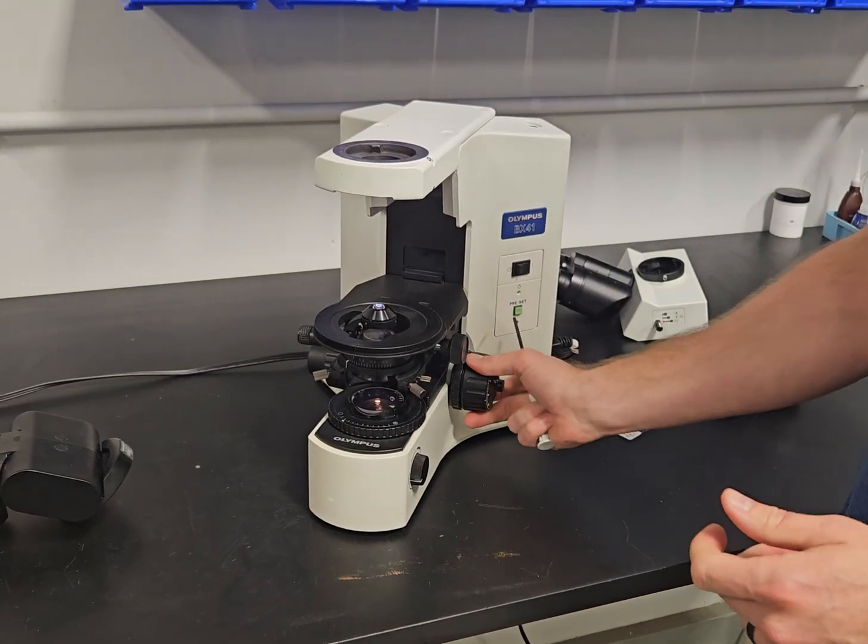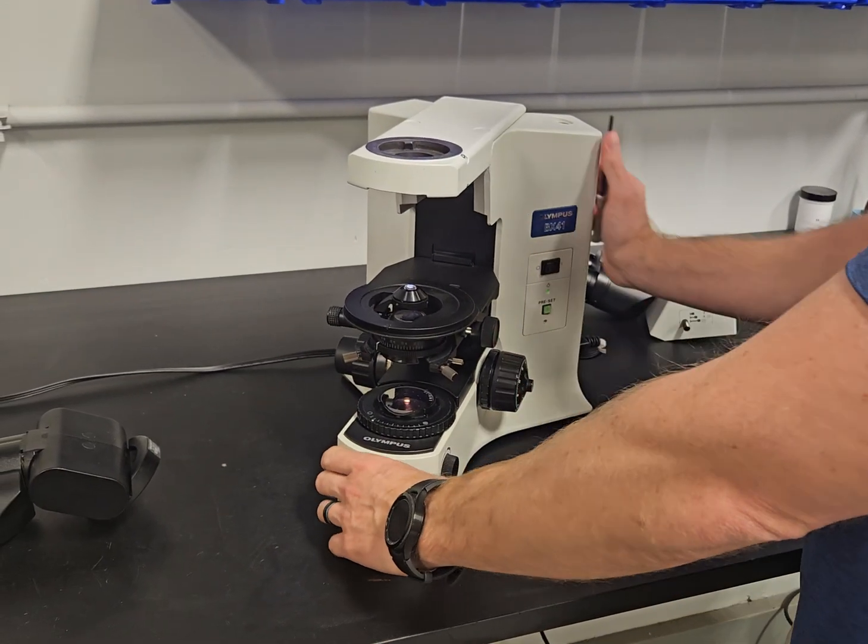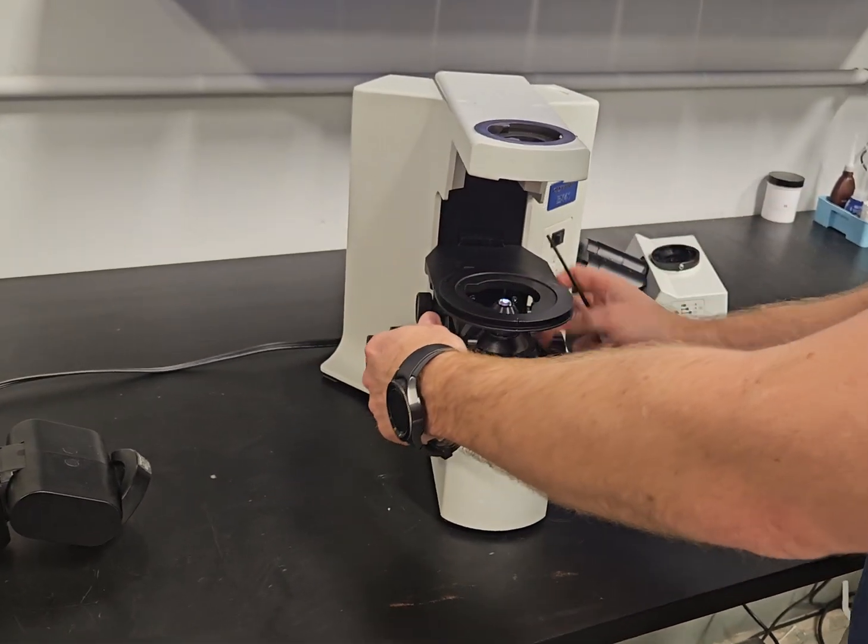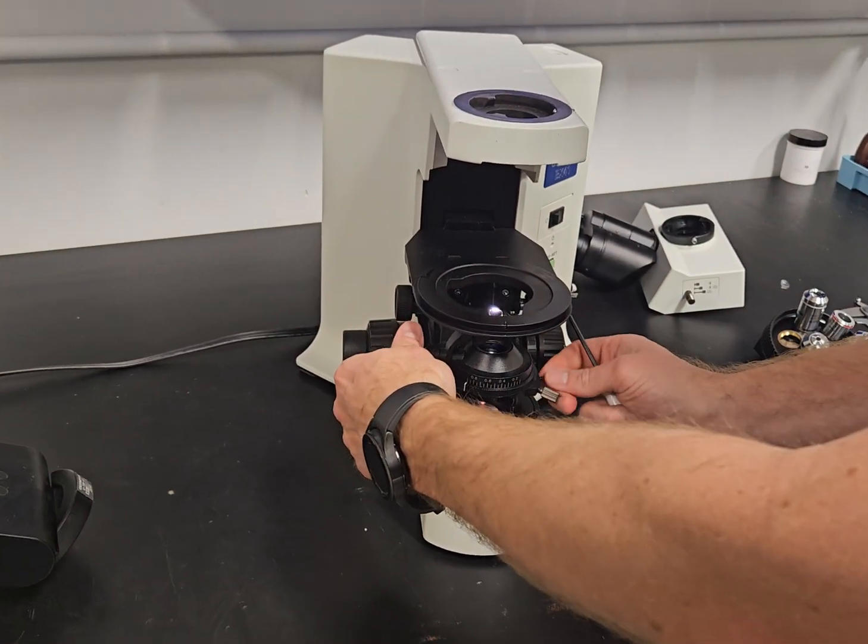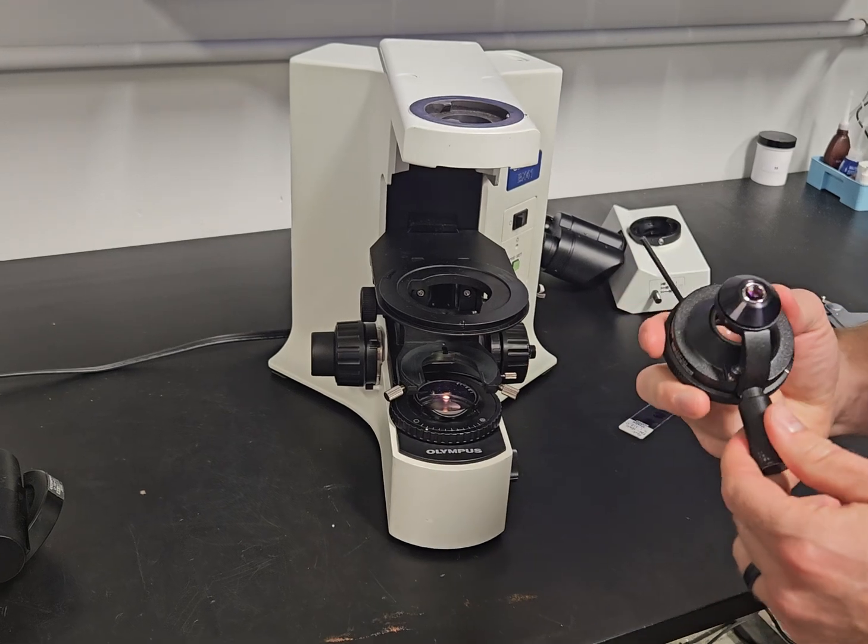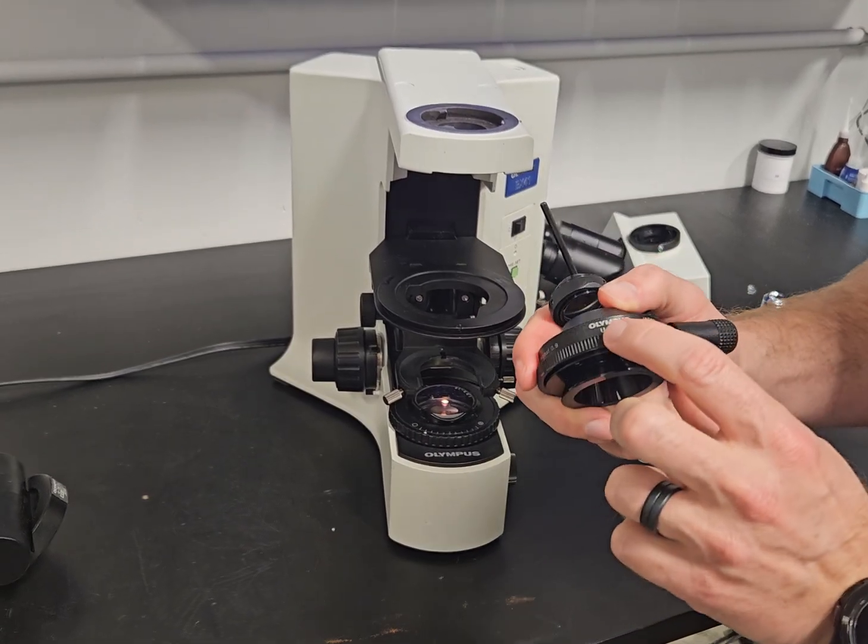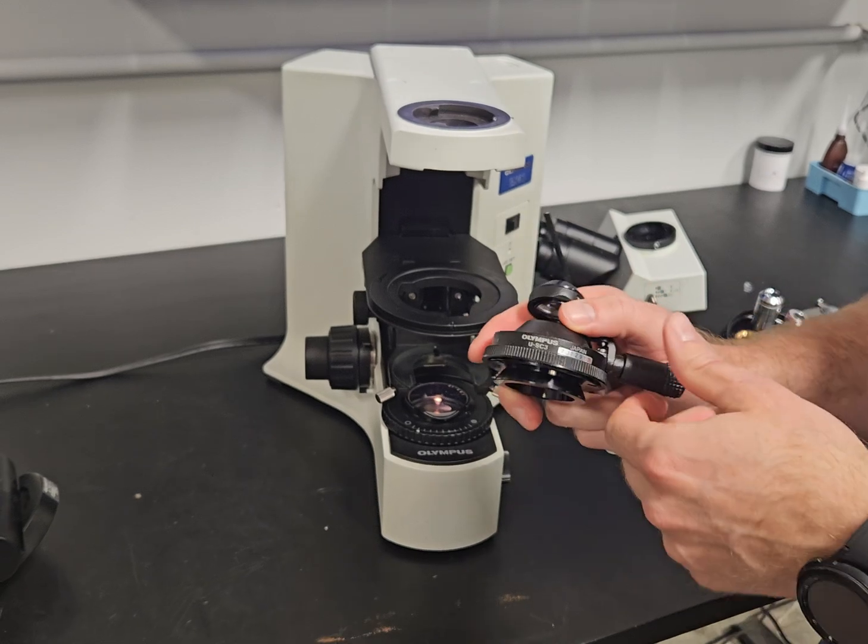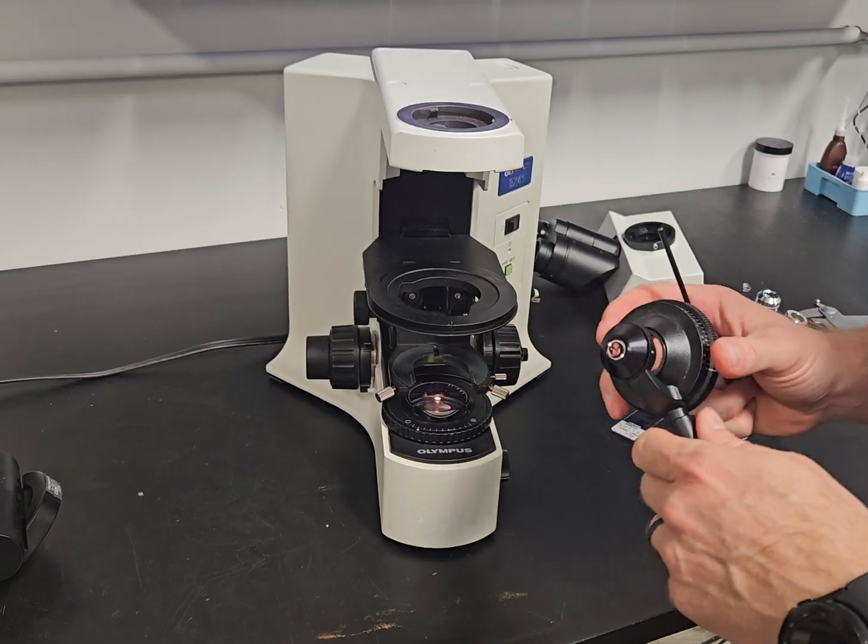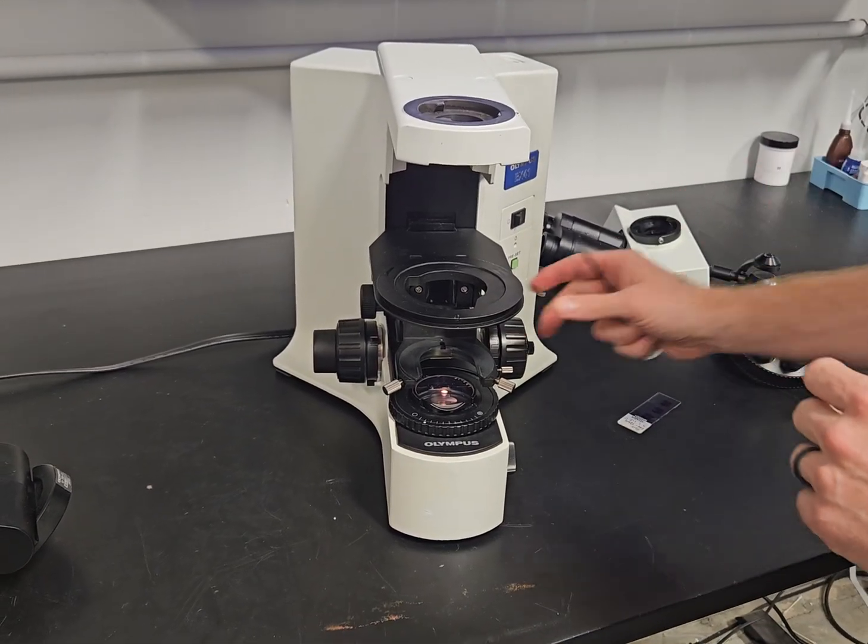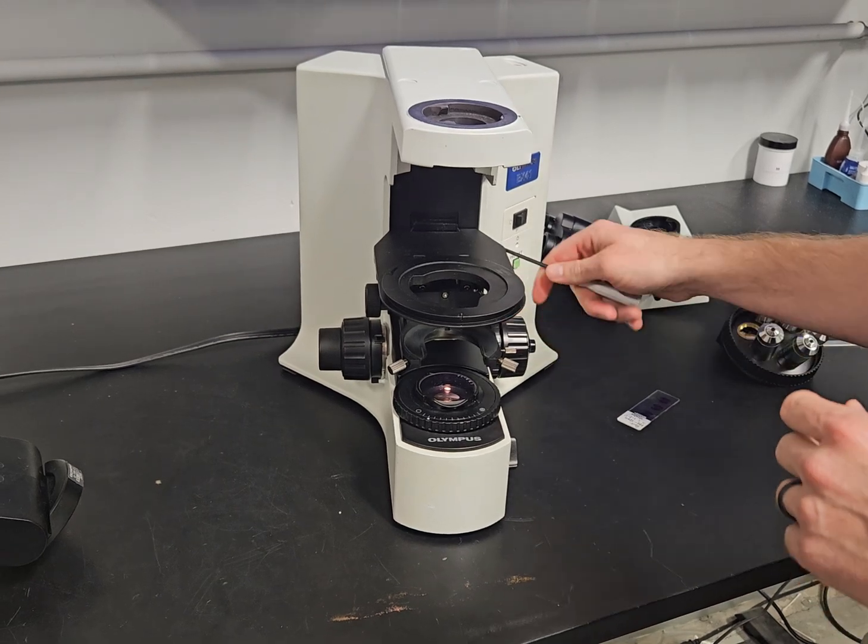Once this is off, we have the flip out condenser. This flip out condenser, the reason that we have this on here is so you can fill the field with the 2X and the 1.25. It's a U-SC3. This is an excellent condenser. You're going to see this a lot or pretty much on all the pathology scopes that use the low magnification.